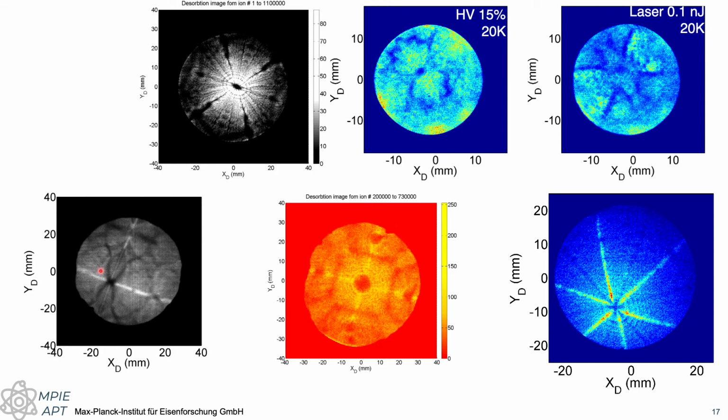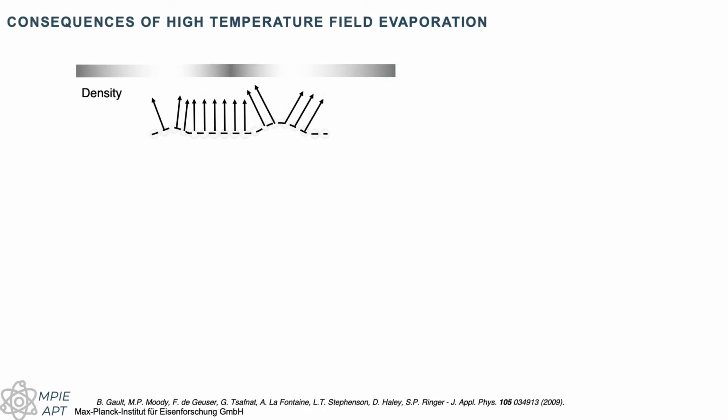And that's just an HCP pattern, just to show how mind-boggling it can be, and it can get quite complicated to identify all of these different poles and sets of planes. So what causes the differences in the point density on the detector? It all relates to the local curvature of the specimen at the surface.